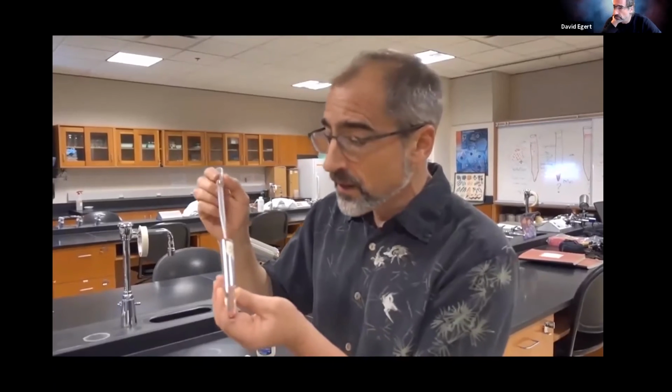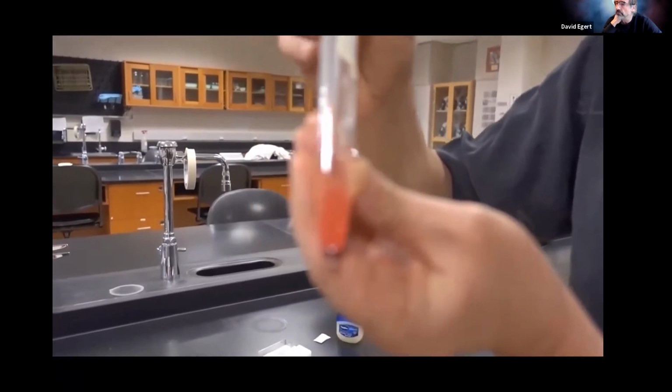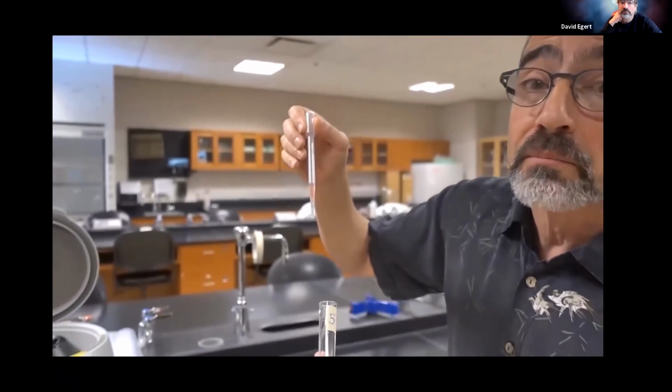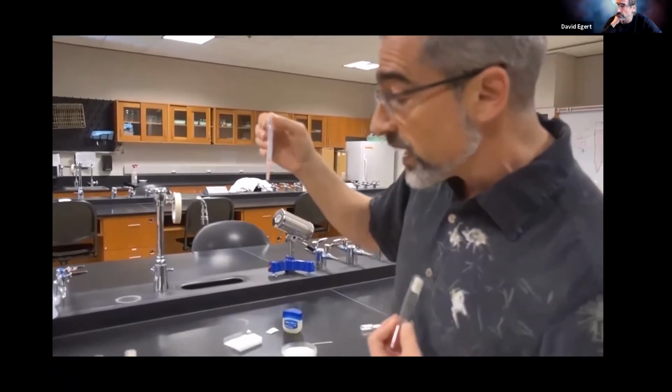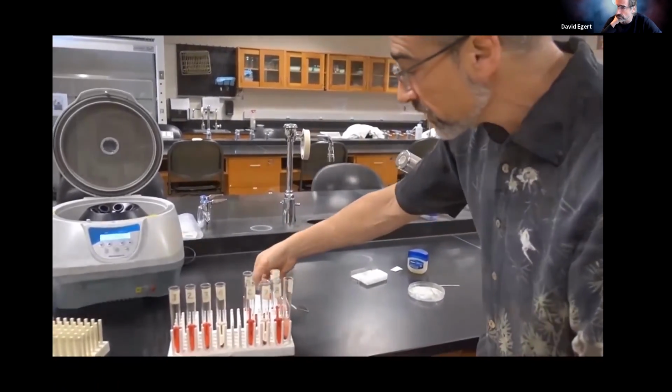Don't get too overly ambitious about resuspending them. You just kind of get a few back up in the solution there, and then you can grab them up, but you really want it to be pretty darn dilute, or else it's going to be really hard to see any individual cells. And then we want to actually create the actual slide.